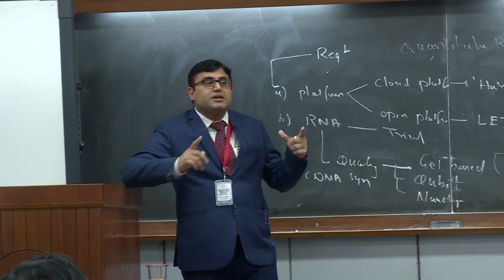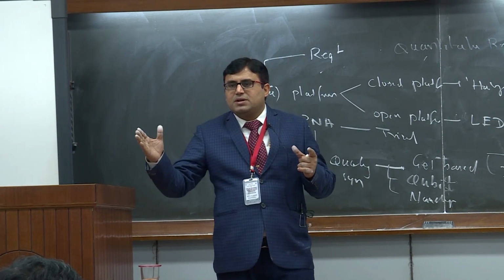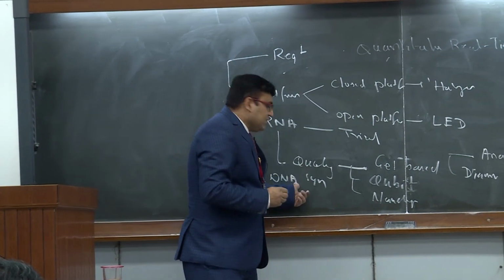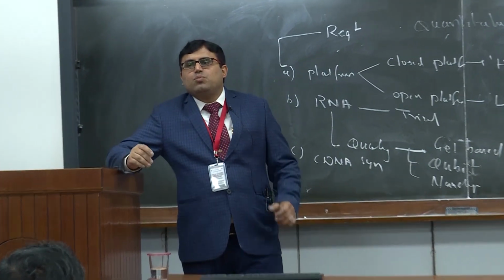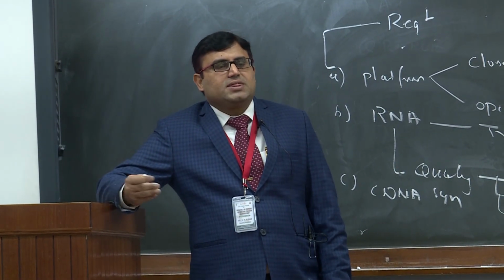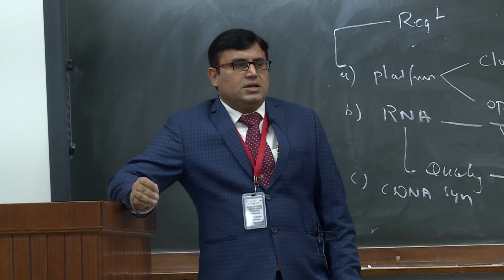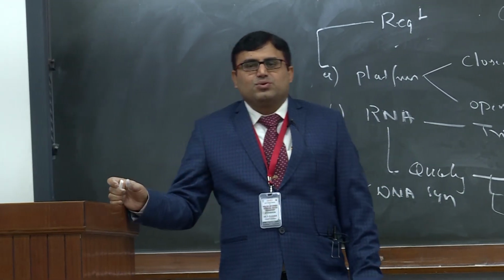So cDNA should not be truncated. It should not be a mix of small and large fragments. It should be homogeneous, uniform, and it should be of high quality. So here you have to use a kit which is a reputed one and has more efficiency. Some of the kits like the Fermentas kit are very popular. Even Takara has its own cDNA synthesis kit, which is very good, and a lot of labs prefer it, right?